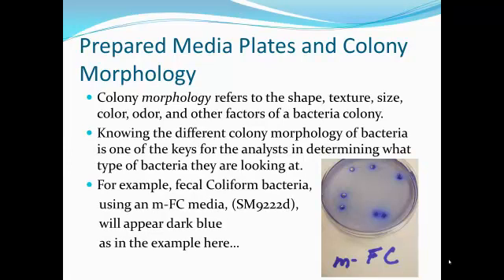For example, fecal coliform bacteria using an MFC media by standard methods 9222D will appear dark blue, as in the example here. That's because they metabolize the aniline blue dye found in the MFC media.